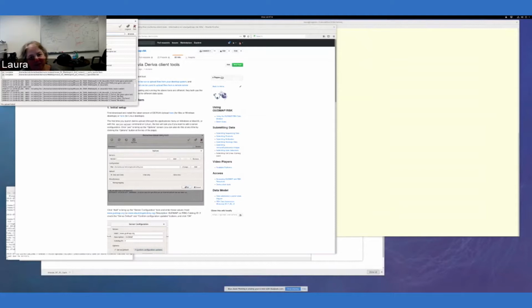And that's actually very useful if you find that you have one problem in a batch of files, or if you upload a batch of files and then you later decide to add one more, it won't do a lot of unnecessary work. So most of these are complete. There are these 2 that have runtime errors. And those are a little difficult to parse, but basically what this says is that it can't find anything in the database that is associated with it.